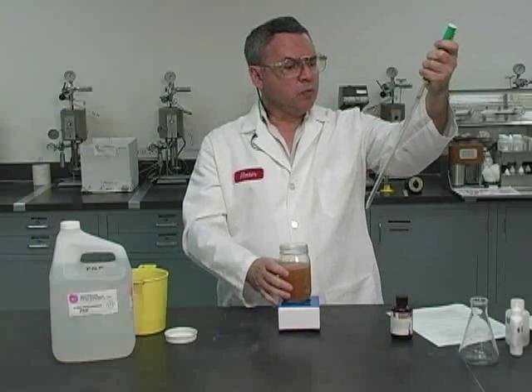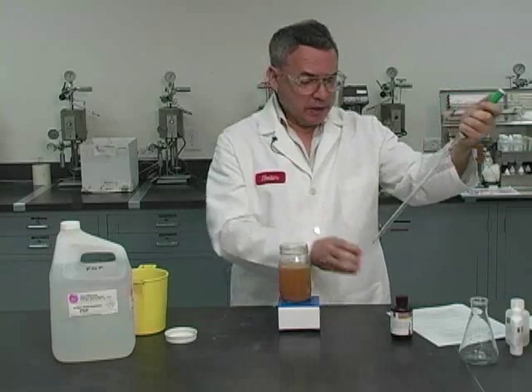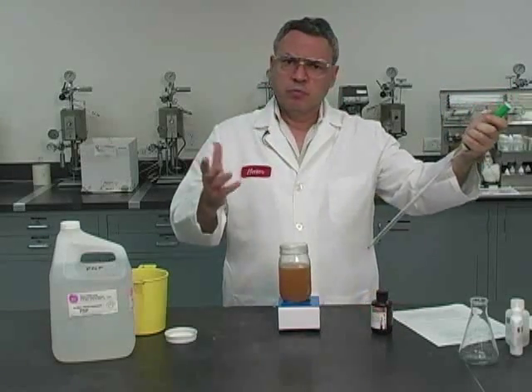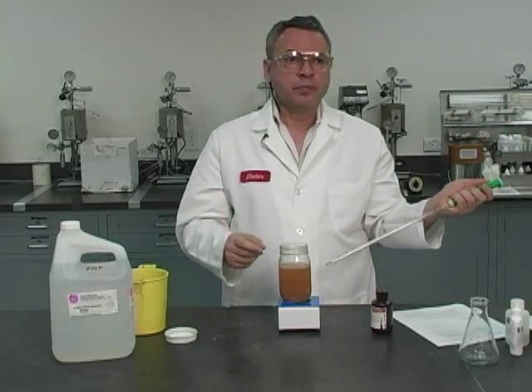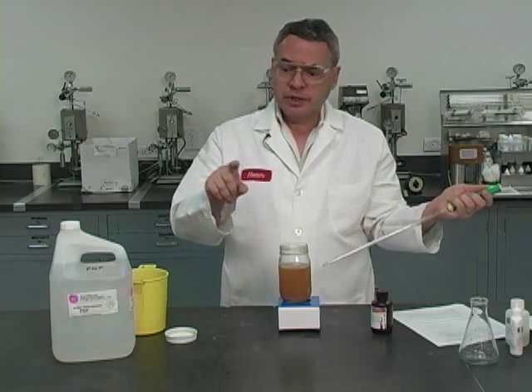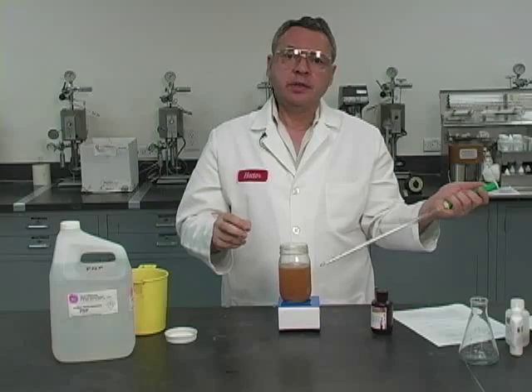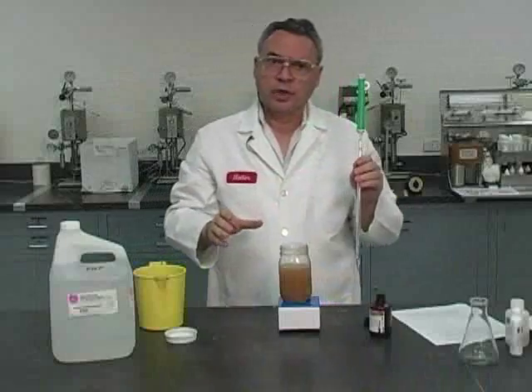And we got it with 9.4 cc's of silver nitrate, the one which is most concentrated, 0.282 normal. So briefly, the calculations would be 9.4 times 10,000, that comes to about 94,000, divided by 2, which is the size of the sample. We got 2 cc's. So we come to 47,000, and this is milligrams per liter of mud, of whole mud. That's practically the salinity of this invert emulsion we just checked. And this concludes the determination of chlorides.